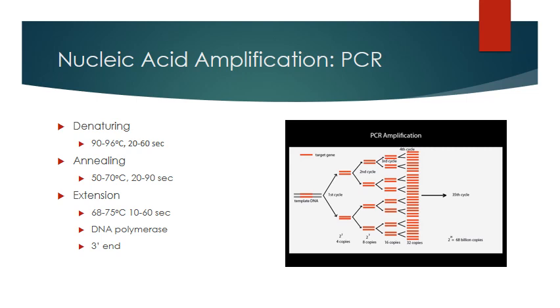And you can see in the cartoon that I have here, you haven't replicated the entire sequence. You've only replicated the target sequence. Then in the next cycle, cycle number 2, you are going to denature those 2 pairs, and you're going to anneal the primers. You're going to have to add more primers because now you're going to have double the amount of targets. Usually you should have enough primer there for the whole thing. So you're going to add the primer again and nucleotides so that the whole process can occur over and over again.